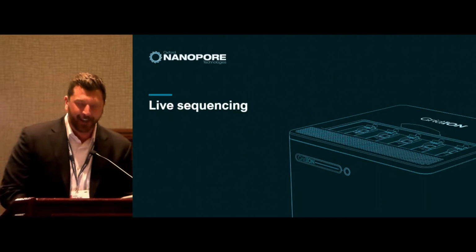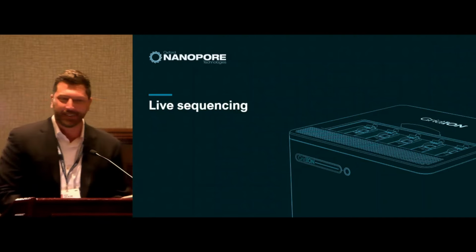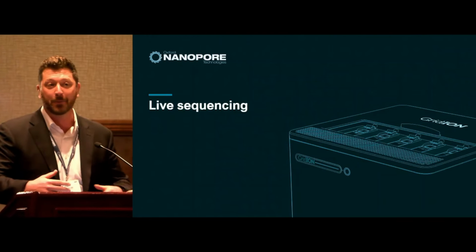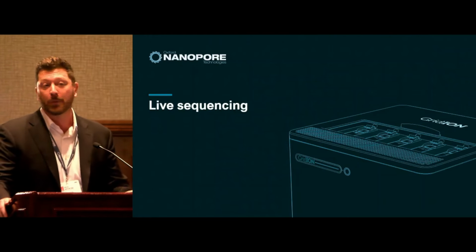Thank you so much, Ryan. That was fantastic to see the evolution of sequencing accuracy over time in bacterial genomes. And I think one interesting thing to call out, too, is that some of the recent gains have not been with the chemistry themselves, but really just the machine learning teams reading out that signal and making those improvements just on the data that's been generated. So with that, let's go ahead and switch back over to our live sequencing demo, see how that's doing. And remember, in a moment, we're going to show that QR code. So be ready after Carly gives us a couple more hints.